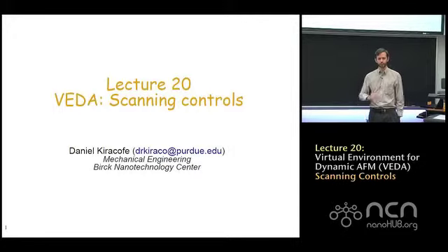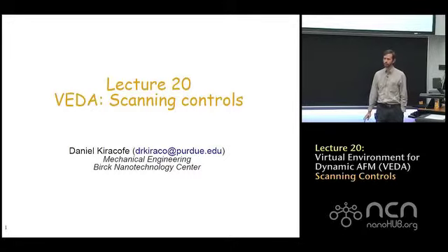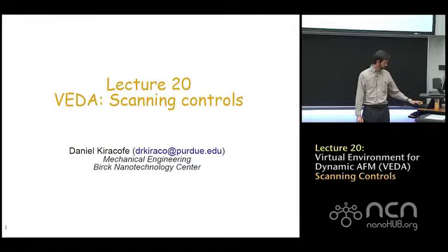And now we get to what you really signed up to take this class for, which is scanning, getting an image of something. So I'll be talking about two different tools in here. First, I'll talk about the contact mode scanning tool and then the amplitude modulated scanning tool.